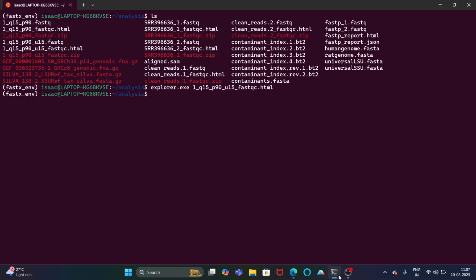Similarly, I will use the cutadapt command that you have used, right? Instead of trimming from the farthest end, I will type in a command 80 and I will trim each insert to 81 length. So the insert length will be 81 here.